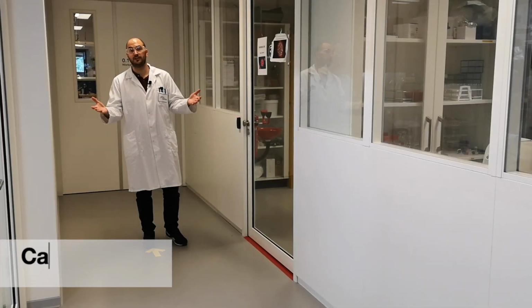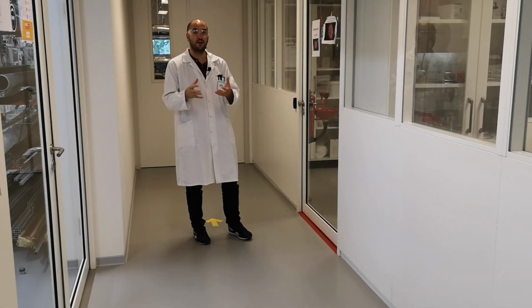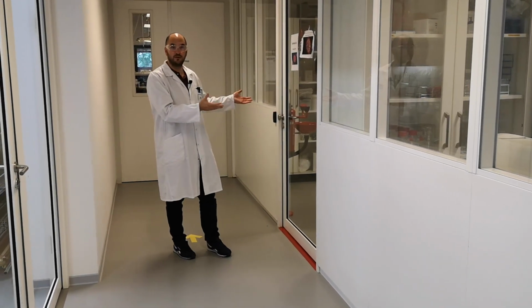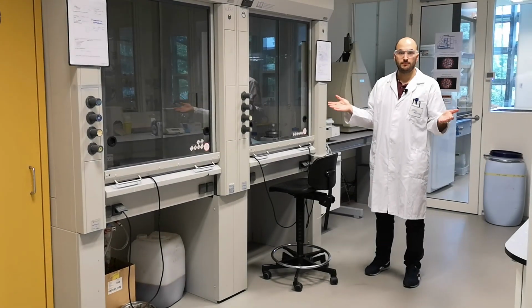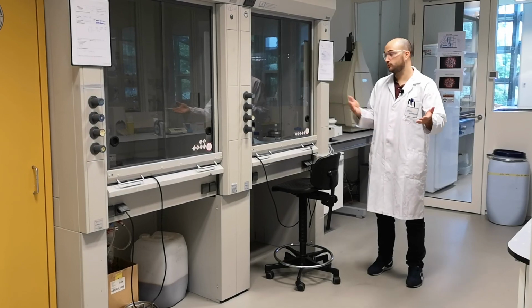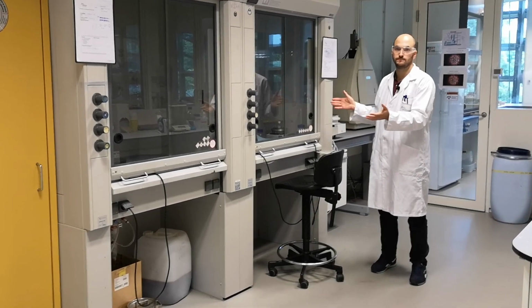And maybe you're wondering if I do have a setup. I don't have a proper setup, but in my project I need to synthesize nanoparticles. Together with other people who are also synthesizing membranes, we have a synthesis lab where all the synthesis can be performed. Let's go inside and take a look. And here we are in the synthesis lab, where we have all the specific materials, chemicals, tools and equipment to perform synthesis of our materials from membranes to nanoparticles, like in my case. Here I can perform my wet synthesis with controlled conditions.